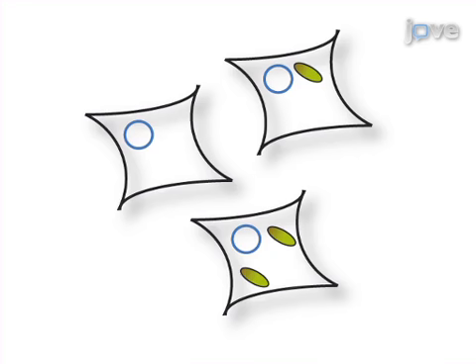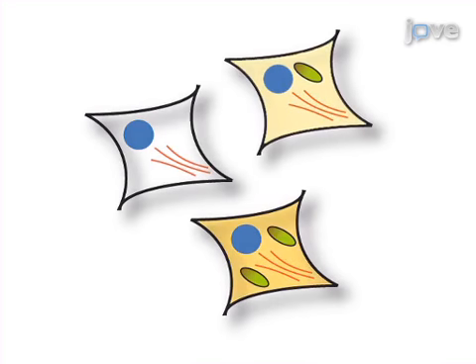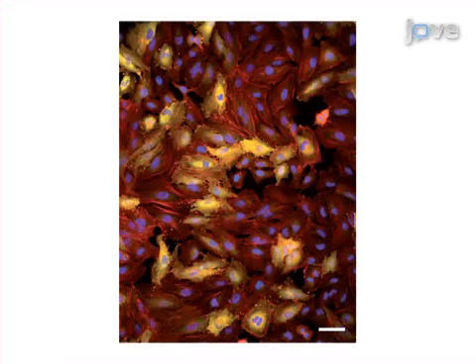Next, infected cells are processed by immunofluorescence in order to label the cellular nuclei, the actin cytoskeleton, and the bacterial protein InlC. Results are obtained that identify infected cells and distinguish them from non-infected cells based on microscopic analysis of the distribution of the InlC protein in individual cells.